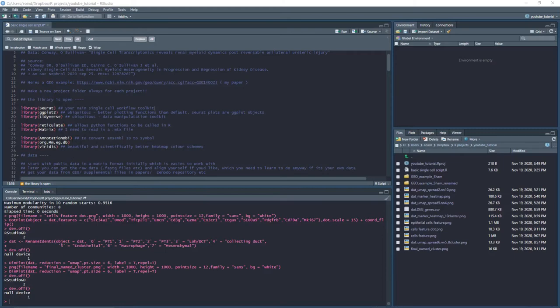I just explained what each package does here, and I'm going to use the Seurat package to take us through the workflow. There are other ways to do this. You can do it with SC3, for example, or you can do this in Python, which is excellent. The main reason I'm using Seurat is simply familiarity. It's how I learned and it's what I'm most familiar with.